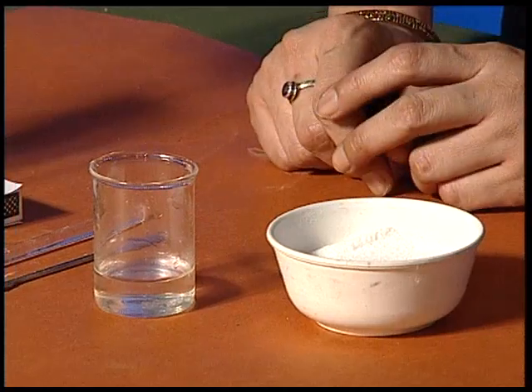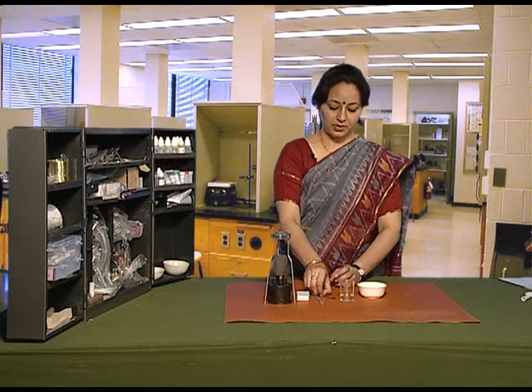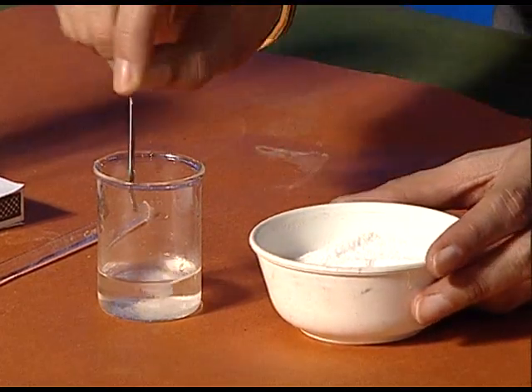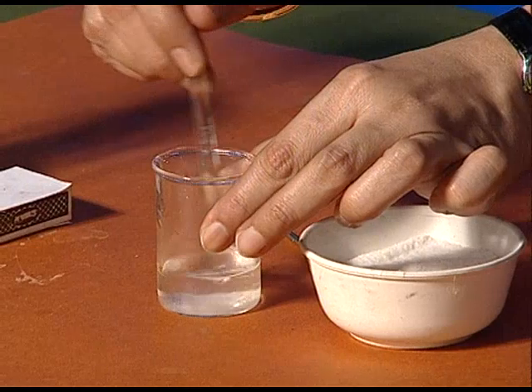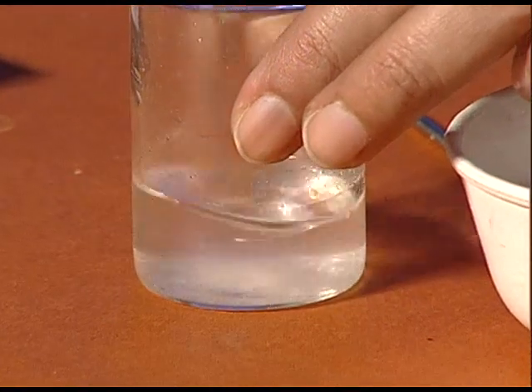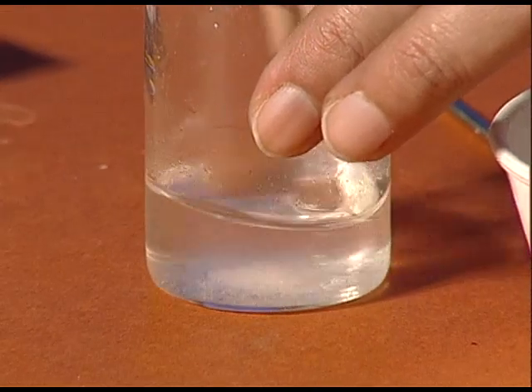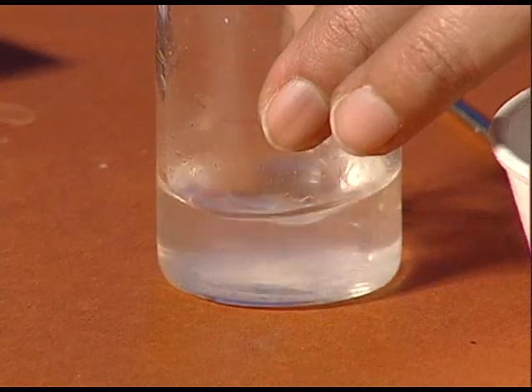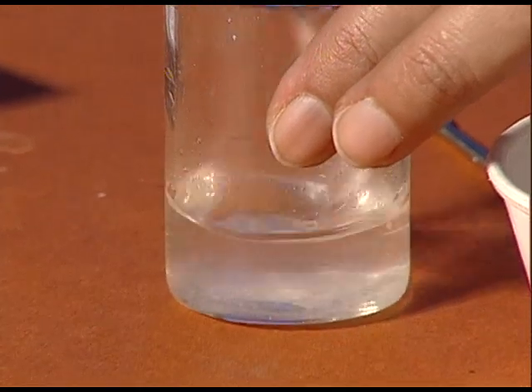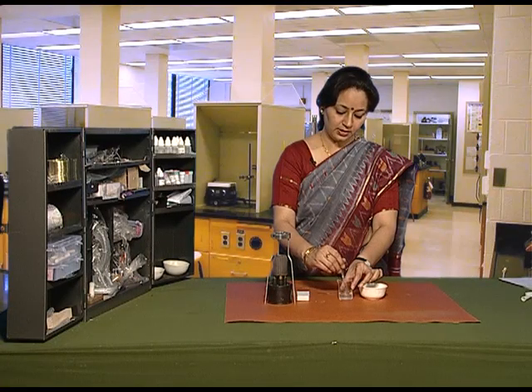We will prepare a saturated solution of common salt in water by continuous addition of common salt with constant stirring. We will see that for a period of time, salt keeps on dissolving in water and forms a clear solution, but on continuous addition of salt, the salt stops dissolving further.